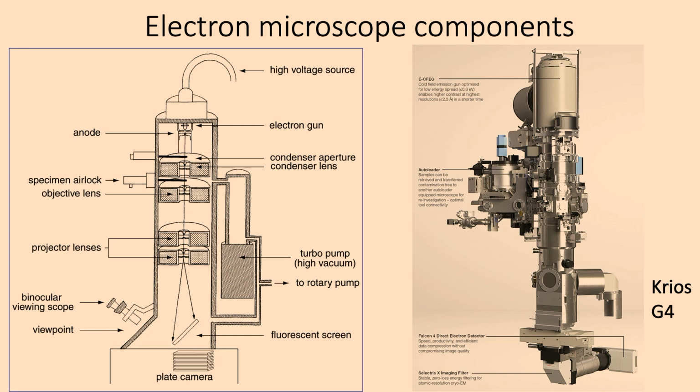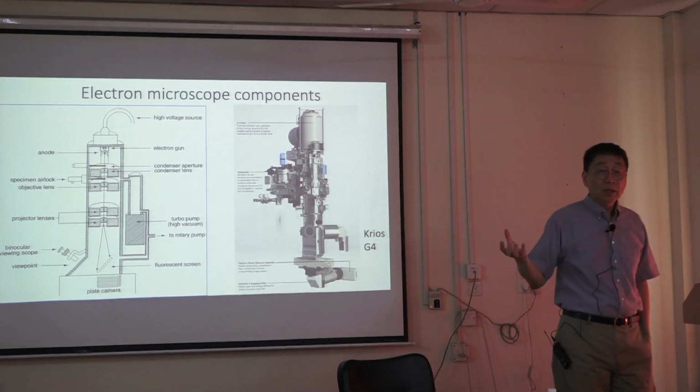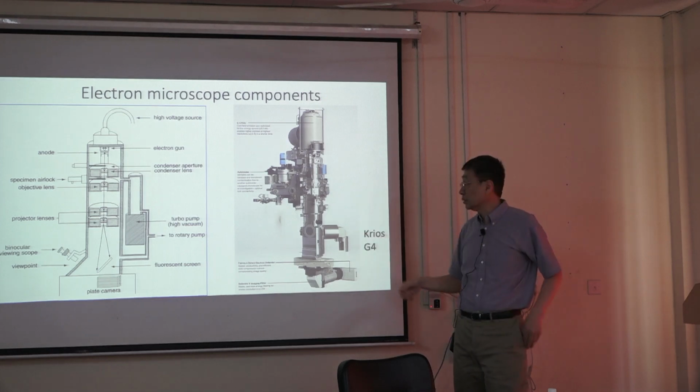You see blobs. But because of this technological breakthrough, if you will, that enabled us to determine structure. I'll explain how that came about. Okay, so essentially samples are loaded here, something called the autoloader. Essentially, everything is controlled by computers. Not much direct human intervention anymore. So you can see the basic is a big box, a magical black box that gets you the structure.